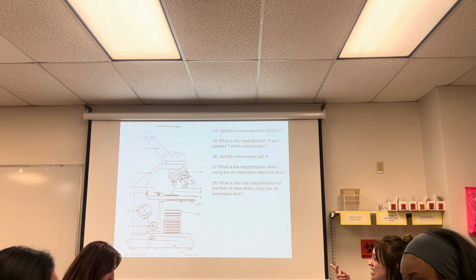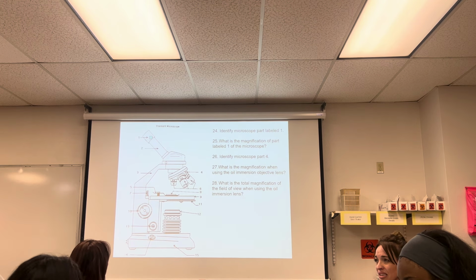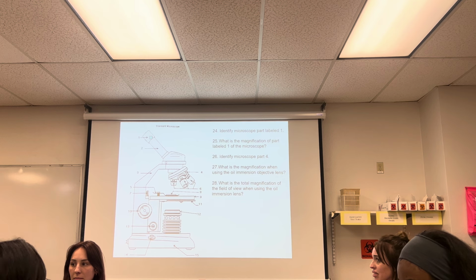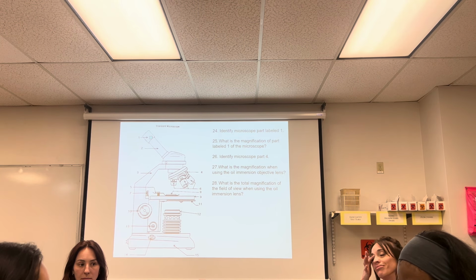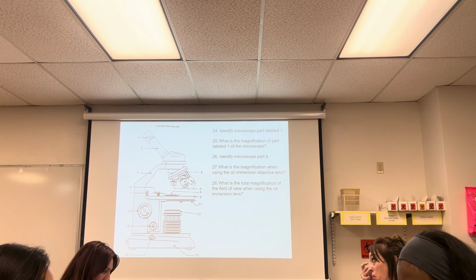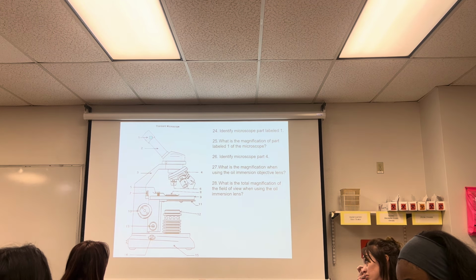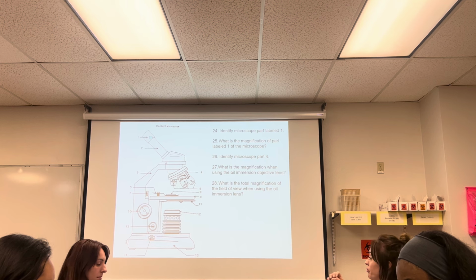I think that was 14. It is. No, it's because it's similar to this one. Oh, they're all a little bit different. I think for that microscope, the little ones are fine too. But the ones we use, it's in the middle of the course. The little one, no matter on what scope, is always the fine adjustment. The big one is always the coarse adjustment. On the other side of the scope, a lot of times we'll only have the fine, not the coarse.